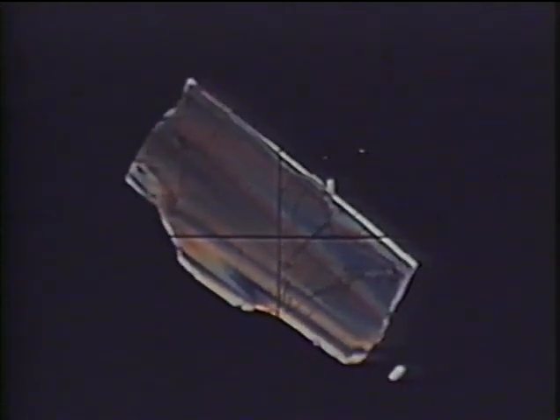It has been expedient to confine ourselves to the use of monochromatic light. In practice, however, the sense of color may be an invaluable aid to correct identification. And it's proposed at a later date to augment this film with a colored supplement.